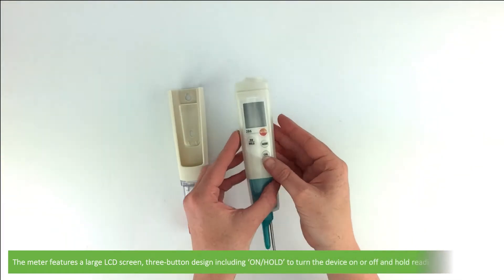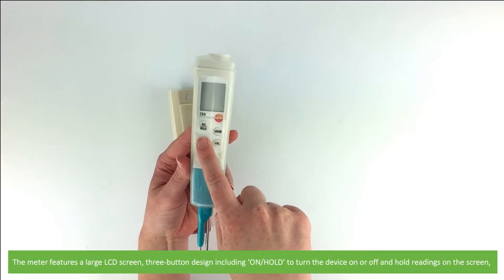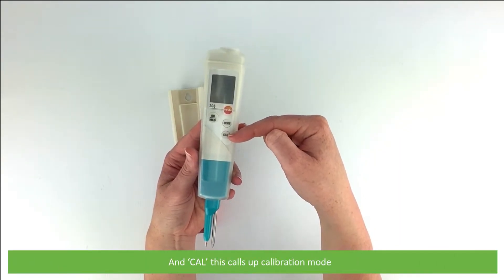The meter features a large LCD screen and a three button design, including: on/hold to turn the device on or off and to hold readings on the screen; mode, which changes functions; and cal, which calls up the calibration mode.